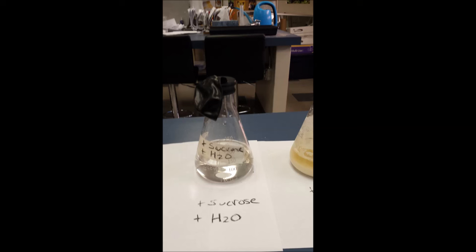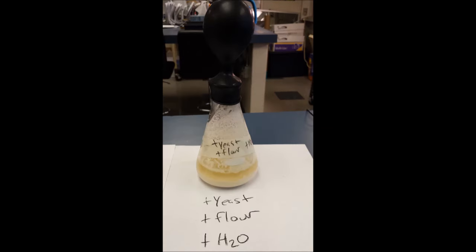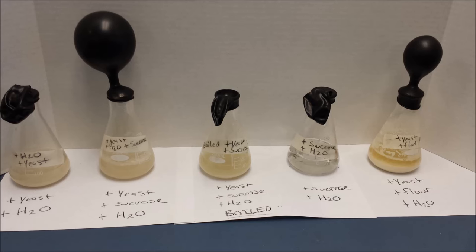Fourth flask, we had sugar and water, but no yeast. There was nothing to do the fermentation reaction, so no fermentation occurred. And finally, in the fifth flask, we have yeast, flour, and water. Now flour is a little bit more of a complex carbohydrate than sugar, sucrose. It's a big polymer made of many, many glucose molecules. So it's going to take those yeast organisms a little bit longer to break that flour down into glucose to use for fermentation. So because of that, there's some CO2 produced, but not quite as much as with the sucrose.